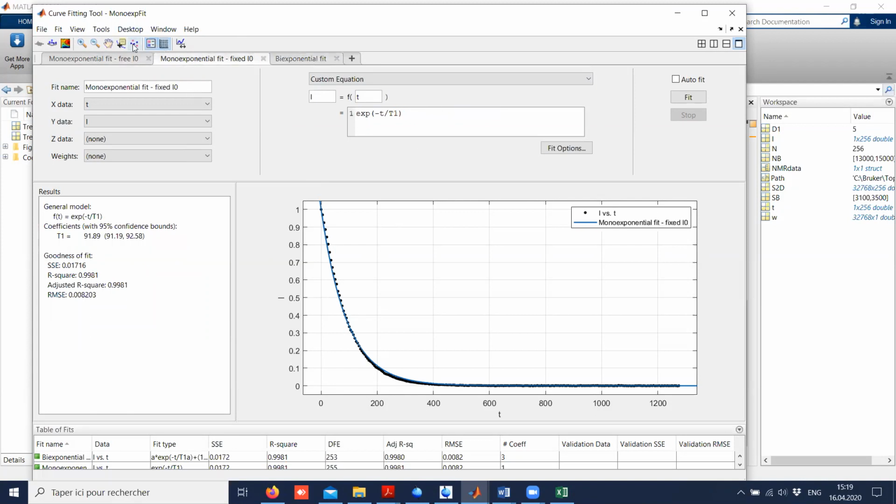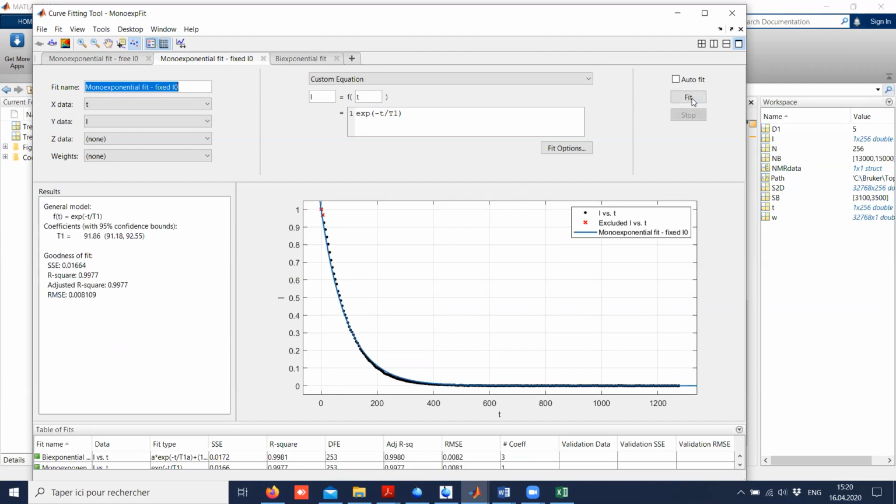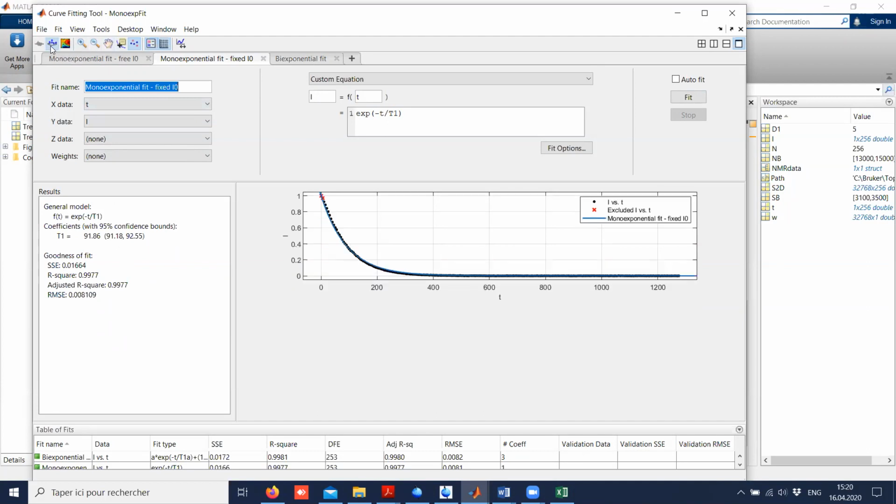I'm going to open this one. So, exclude outliers. For example, I might exclude outliers here, saying, okay, these 2 points in the beginning, I don't want to include them in the fit. Quite interesting. And another one that is useful, residual plots.